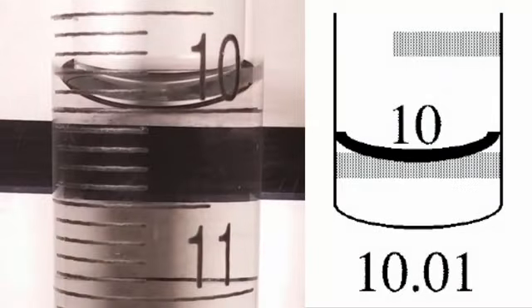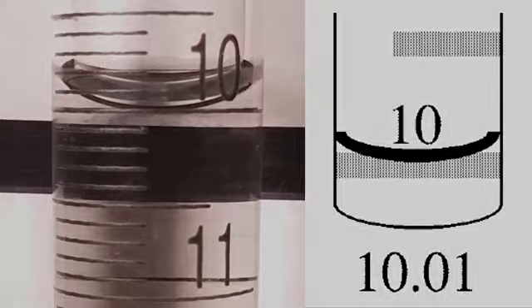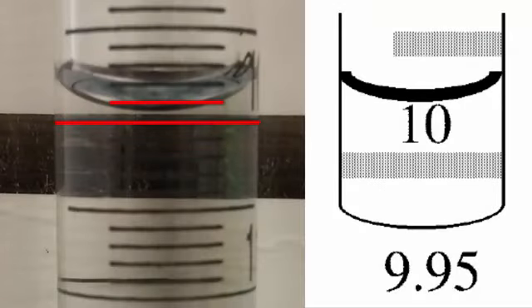In the fourth example, the meniscus is just below the top of the 10.00 line, so the reading is 10.01. In the last example, the meniscus sits halfway between the top of each line, which gives a reading of 9.95. Note that it is not halfway between the two lines. Halfway between the two lines would be halfway between 9.92 and 10.00, which would give a reading of 9.96.